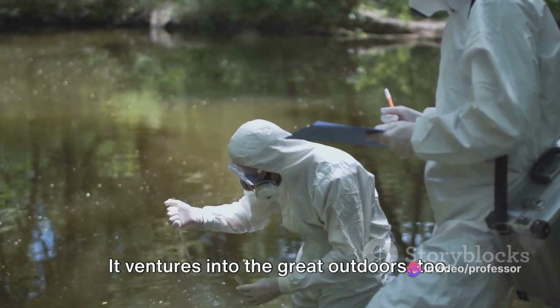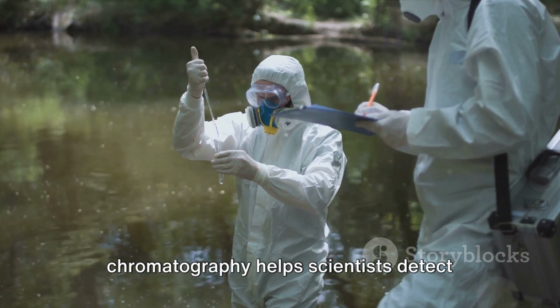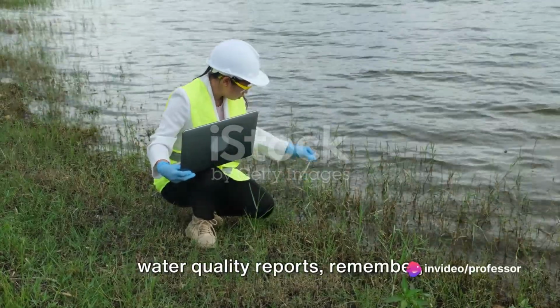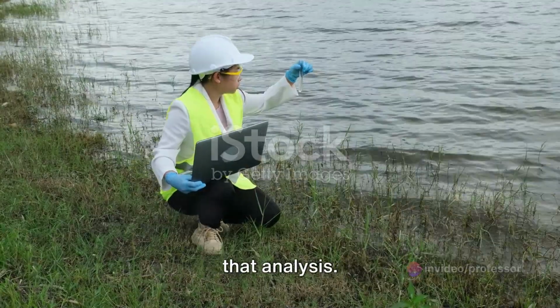But this technique isn't confined to laboratories. It ventures into the great outdoors too. In environmental monitoring, chromatography helps scientists detect pollution levels and identify pollutants. So every time you hear about air or water quality reports, remember, chromatography probably played a part in that analysis.